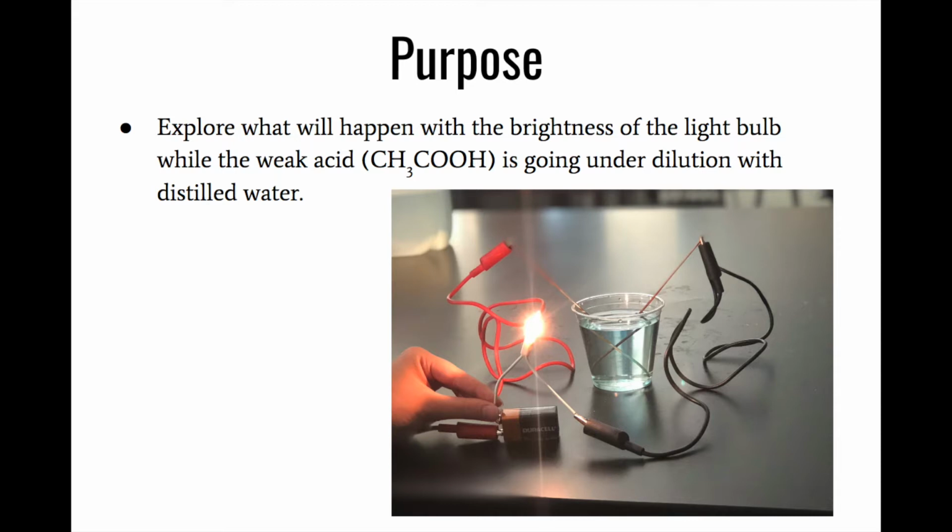To increase percent ionization, the student must dilute the solution with distilled or deionized water. The reason that the percent ionization increases as the solution is diluted will be explored in this lab and further explained at the end of this video.